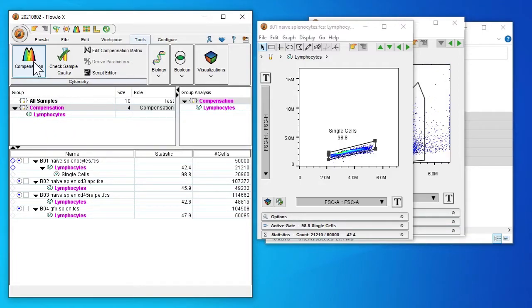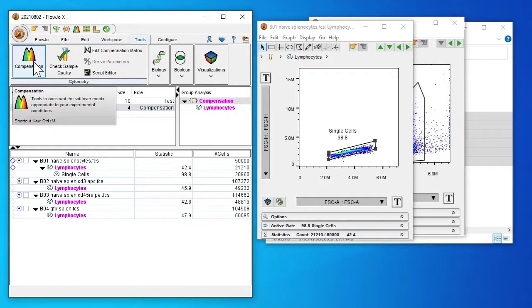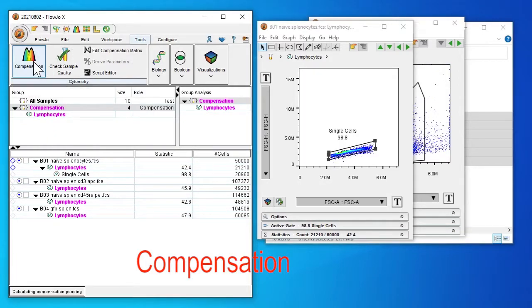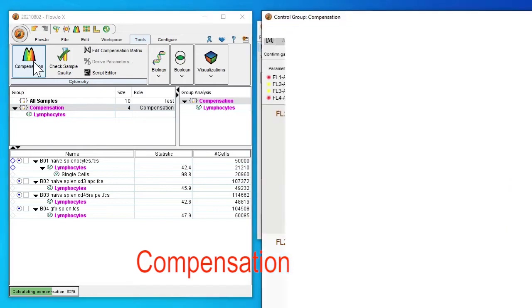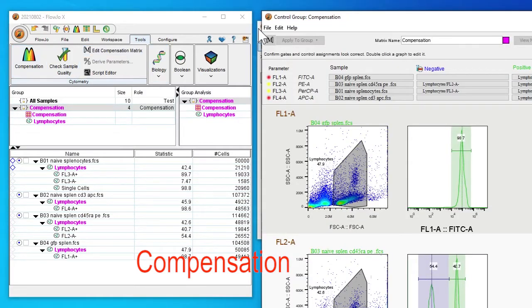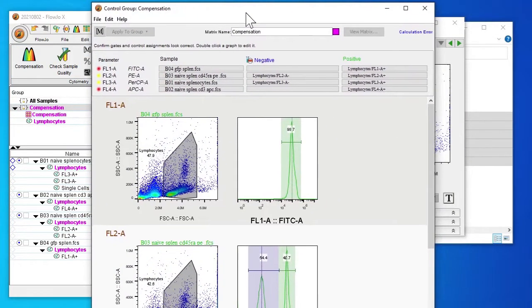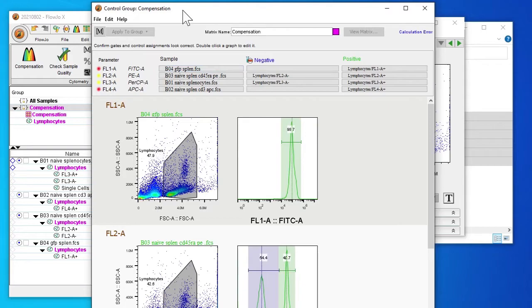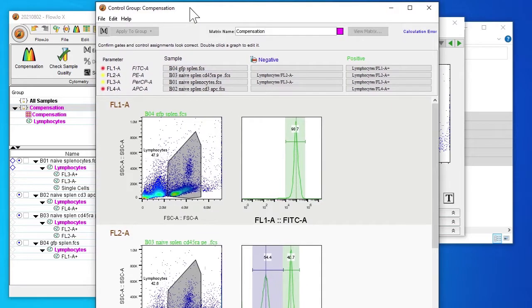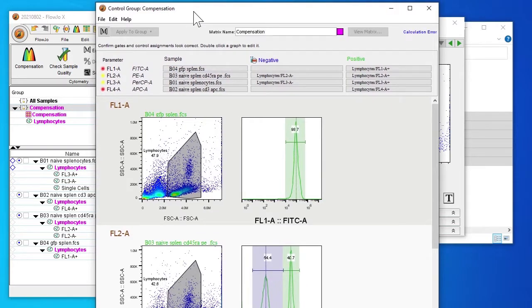Next we're going to perform compensation. This is particularly important when we have multiple colors. As you can see, some of the samples have already been read by the computer depending on the name of the file.